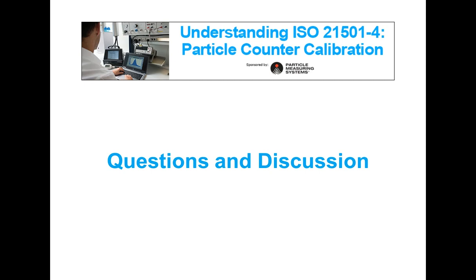So I suggest you don't care too much about a specific time frame, but trust what the instrument is notifying you in terms of alarms and hardware alarms.